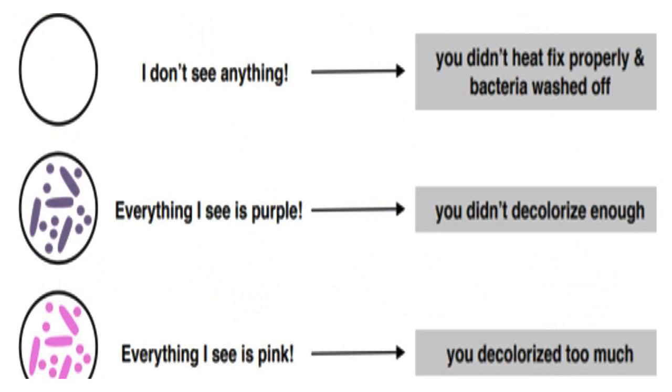If you don't see anything, it means you didn't heat fix properly, leading to bacteria washing off. Meanwhile, if you see everything in purple under the light microscope, it means you didn't decolorize enough.